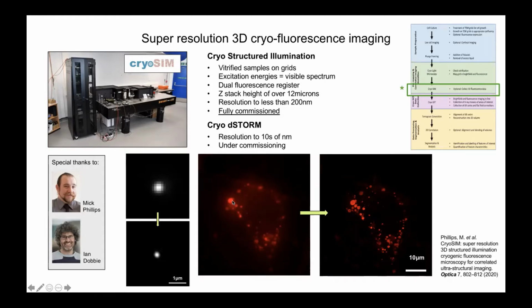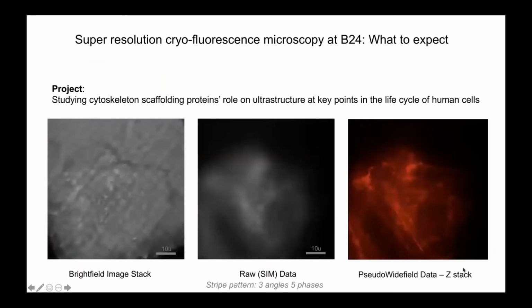In here, you see vesicles that are fluorescent red. These are actually endosomes of a single cell. The cell is here. The nucleus is in the middle where we have absence of fluorescence, and this is diffraction limited imaging and the SIM processing, the structural illumination processing. Now, all this system and its applications, as well as how to build it in some way, is also documented in our Optica paper.